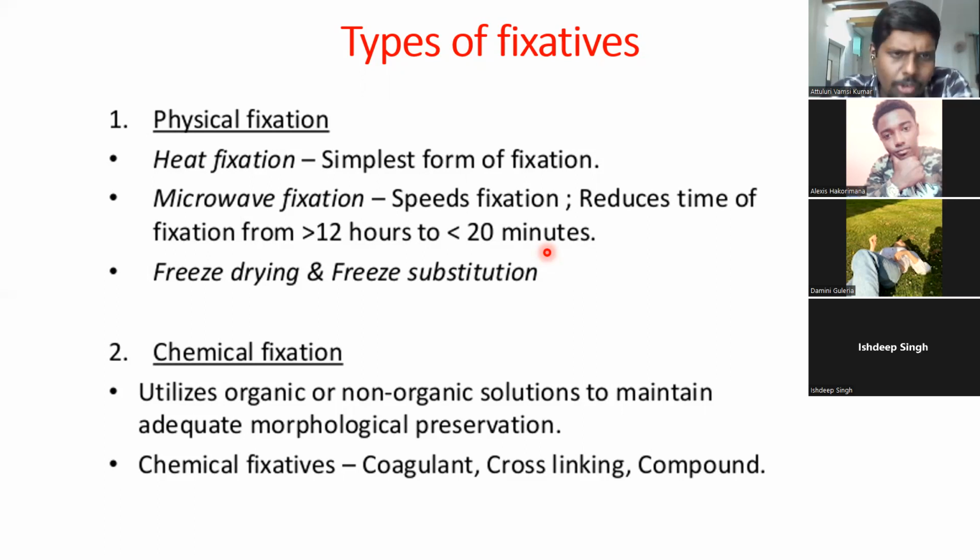And we have chemical fixatives. We have various types and various classifications of these fixatives. Let us have a quick overview of all the fixatives and their types, and then we can go to the specific fixatives used in immunohistochemistry.